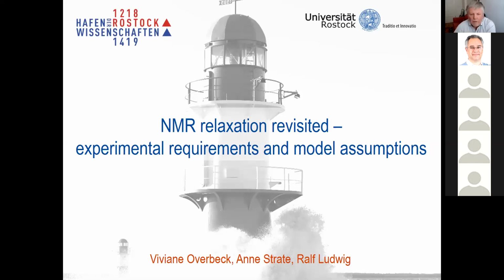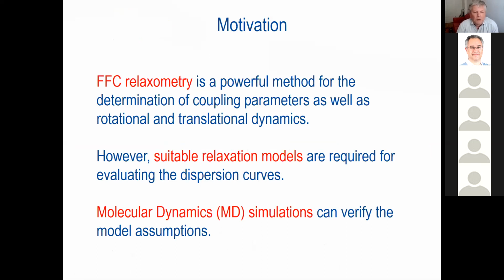So I have one motivation today for you, and this is what is written here. I would like to underline that fast field cycling relaxometry is a powerful method for the determination of coupling parameters as well as rotational and translational dynamics. However, we need suitable models for that, and they are required for evaluating properly the dispersion curves. And thirdly, molecular dynamics simulations can really verify the model assumptions we have for evaluating the fast field cycling data.